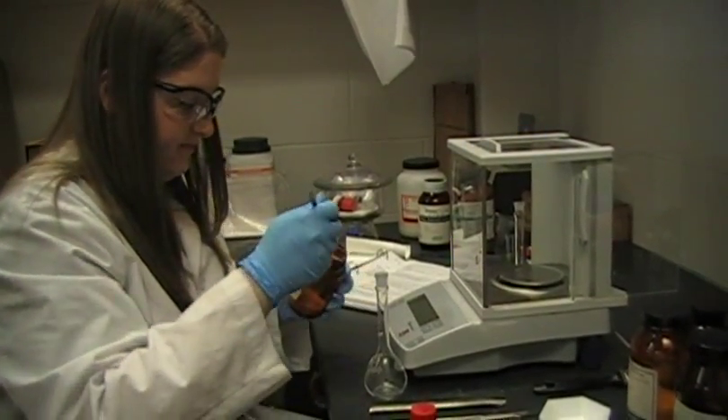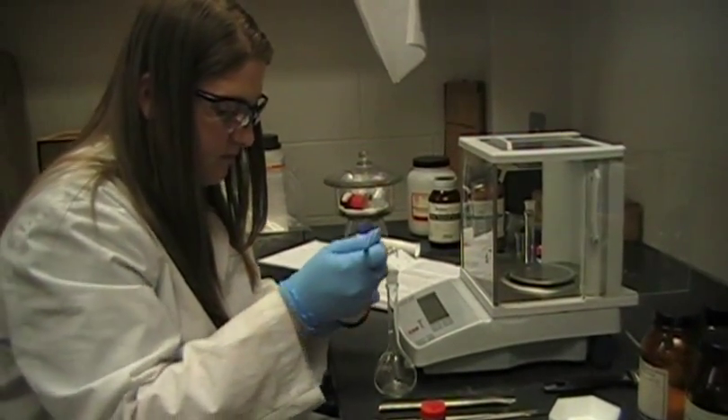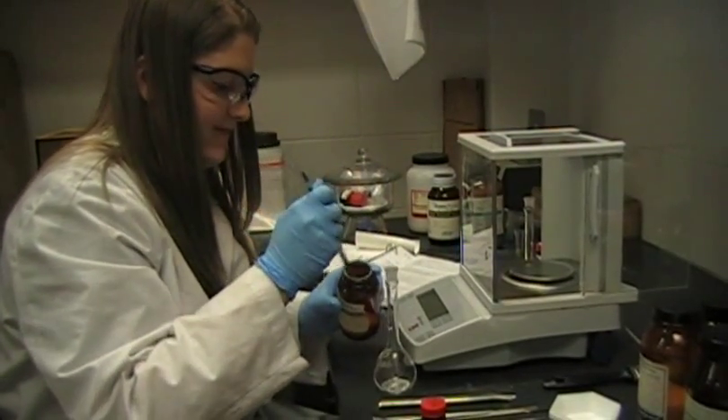The first step in performing both tests is to weigh out the reagents needed accurately. To do this, an analytical scale is used and each reagent is weighed into a flask.